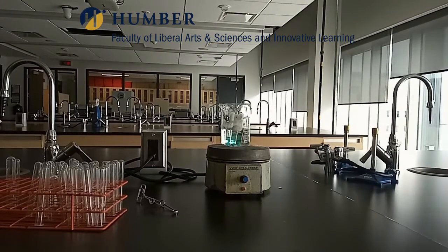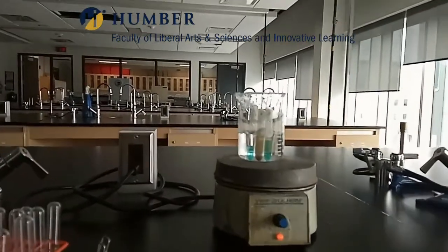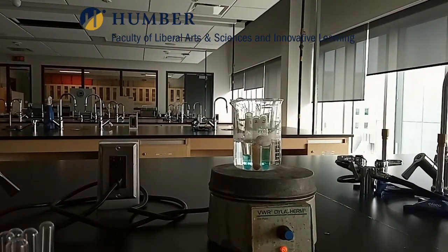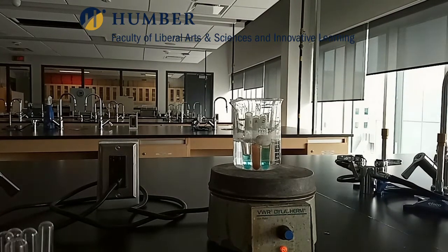Keep the 3 test tubes labeled 1, 2, and 3 in a hot water bath. Wait for about 5 minutes or till the color changes. Observe the color change in test tube number 2. Record your observations in the table.